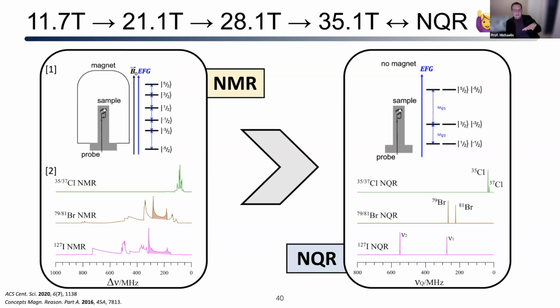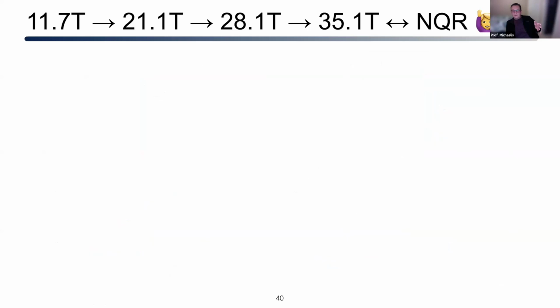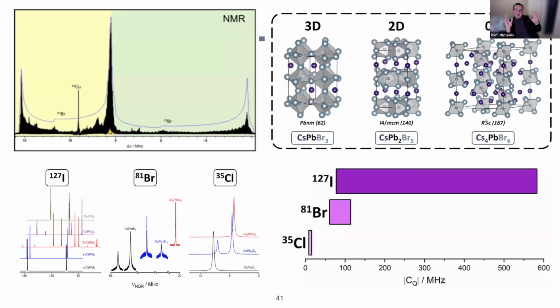Okay, and so what I'm going to emphasize here is not heavily NMR versus NQR, but just some considerations if you're going to do this. This really builds from a lot of the foundational work done by Bryce's group, looking at a variety of halogen NMR nuclei, and some more recent work in perovskites with Kovalenko's group. So what you can see here is bromine, and we wanted to look at bromine in a variety of these crystal structures. Remember that the cesium tin bromide and the cesium germanium bromide had unique crystal structures that may have been changing or slightly expanding depending on the synthetic protocols.